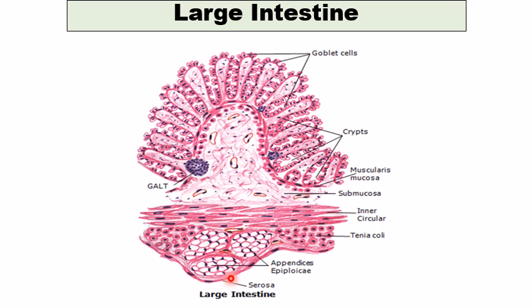Dear students, we have finished the gastrointestinal tract. To summarize, we have oral cavity microscopic slides. For the oral cavity, we have the lip and the tongue. For the esophagus, we have the esophagus.